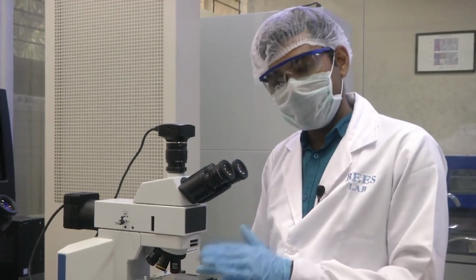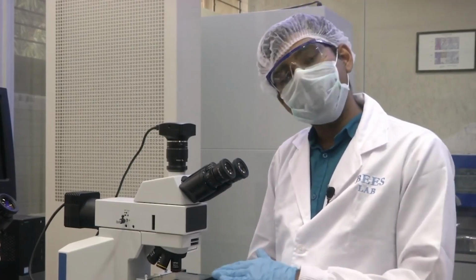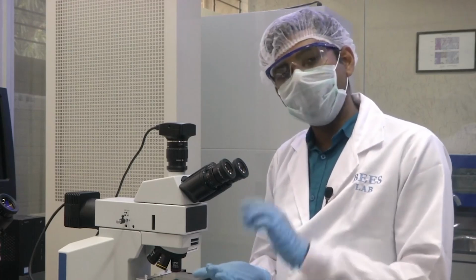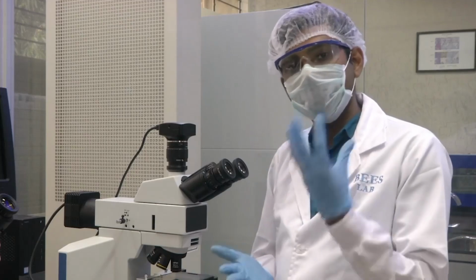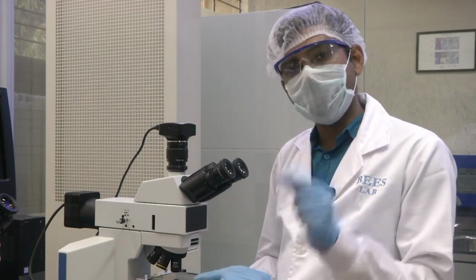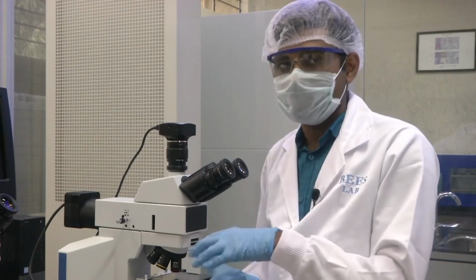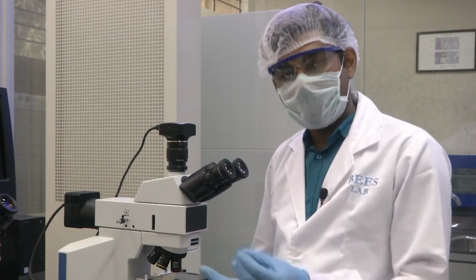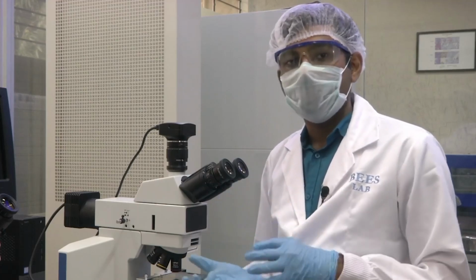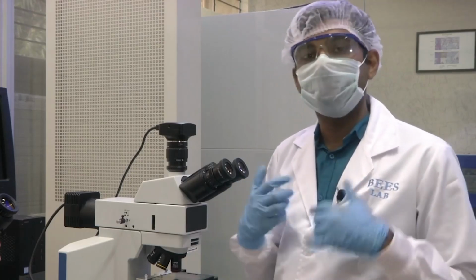So, let us say there is something called nuclear staining of cells. Let us say we have a petri dish containing a lot of cells, and we want to study how the cell's nucleus behaves; you all know the nucleus is the core part of a cell. What we do is, there is a chemical or a dye called DAPI. We add that chemical to the cells. What does this DAPI do? DAPI goes into the cell, goes into the nucleus, binds with the DNA that is there, and once that binding event happens, it starts emitting blue light.